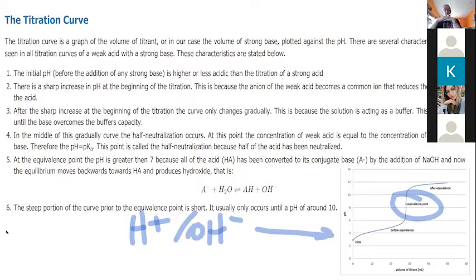And so you get a dramatic change in the pH then, because you go from having relatively similar concentrations to now having much more OH- and having no H+ left over to react with it. And so once you start adding just pure OH-, the pH will shoot up. And so we should see a big increase in pH once you pass the equivalence point.